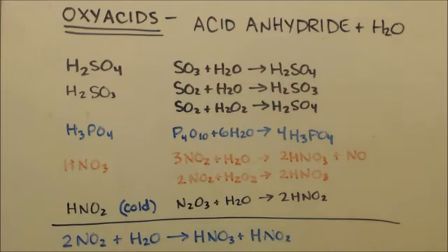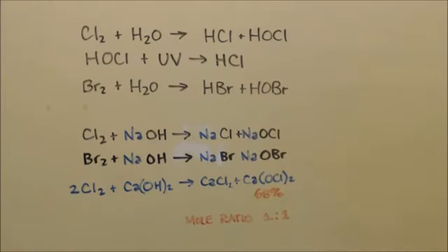And there are always things that can explode or are exothermic. So always ask if you're ever going to do anything that you don't know about, because these are just 15-minute videos trying to give you some tips. This isn't telling you everything. I do have a video on sulfuric acid, not how to make it, but how to get it. I do talk about the dangers in there, so maybe you should watch that if you're going to try to do any sulfuric acid. And hypochlorous or hypobromic or bromous acid.